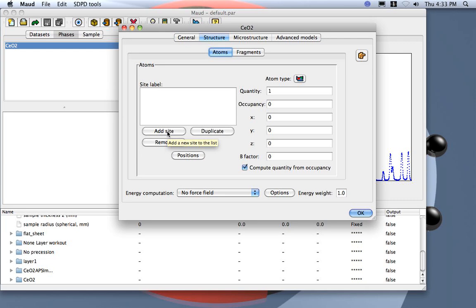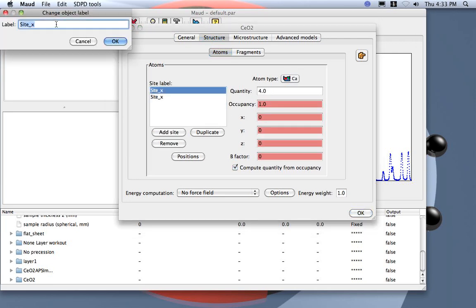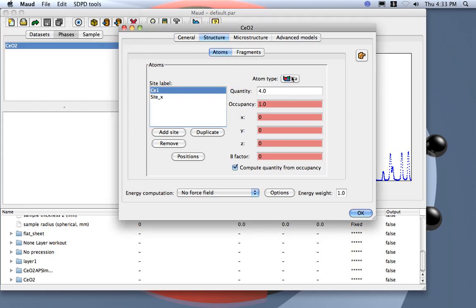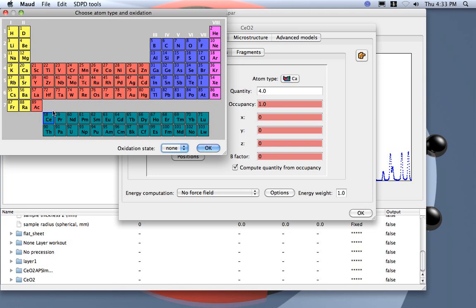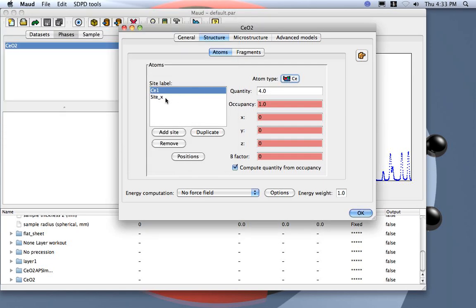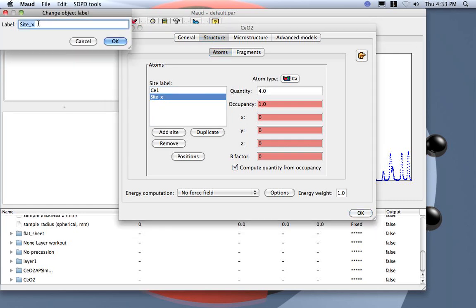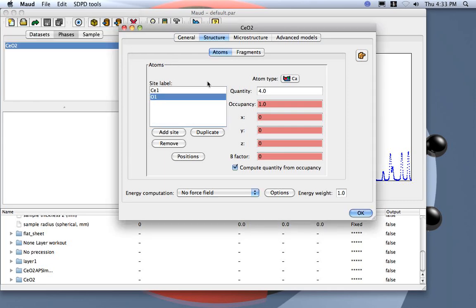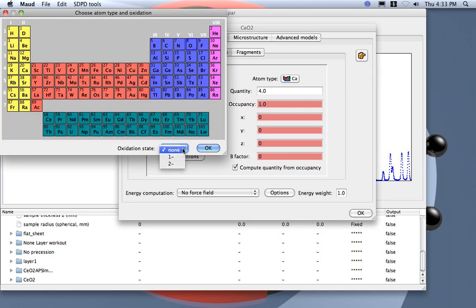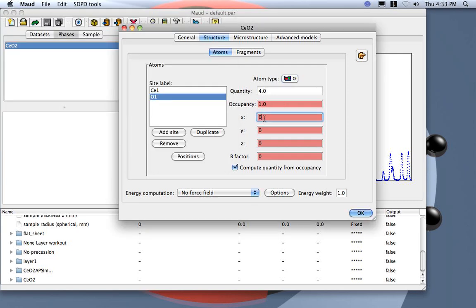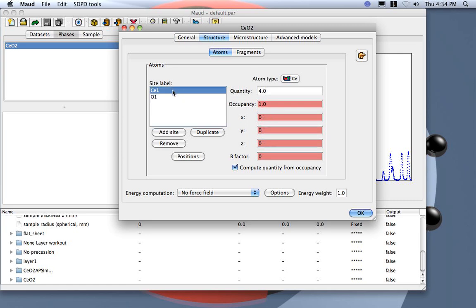For the standard structure we have two different sites: one for the cerium and one for the oxygen. I add two sites. I select the first, double-click and call it Ce1 — this is the cerium atom. For the second site O1, I prefer to use no oxidation state. The oxygen should be at one-fourth, one-fourth, one-fourth. So cerium is at 0,0,0 and oxygen at 1/4,1/4,1/4. You can see the quantities inside the cell are 4 and 8, which is correct.